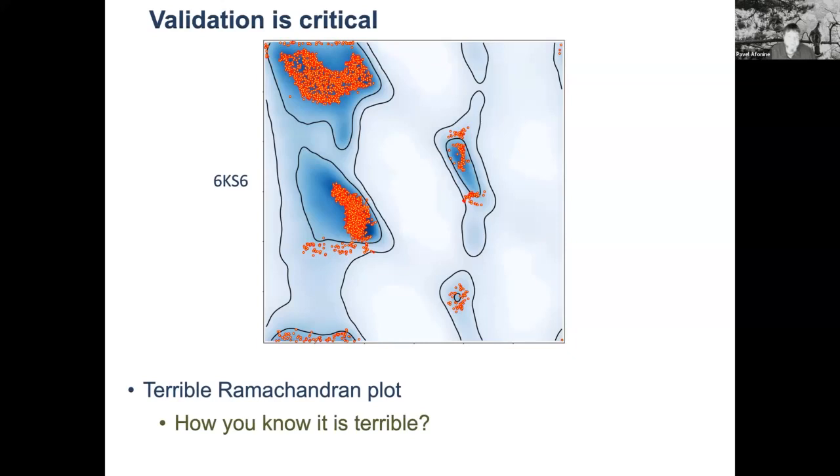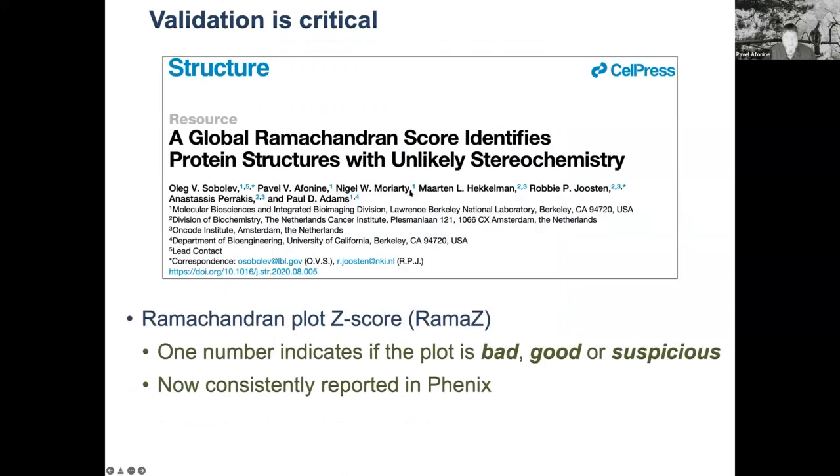So you ask yourself the question, what happens if I don't look at this plot? What happens if I just look at that table of statistics? Then you will miss this bad situation. And so how do you detect this problem? That's how you do it.